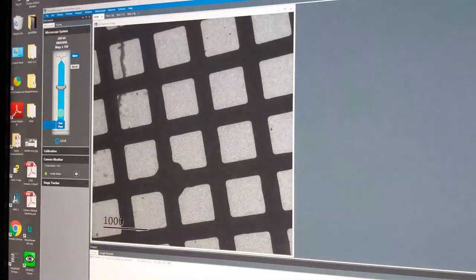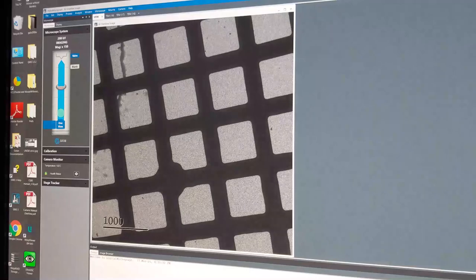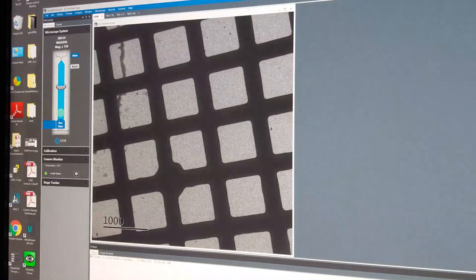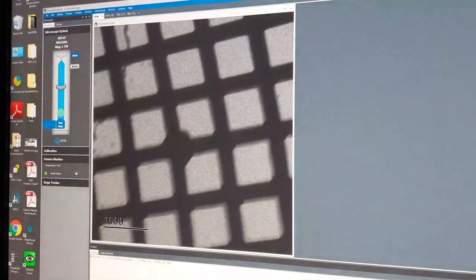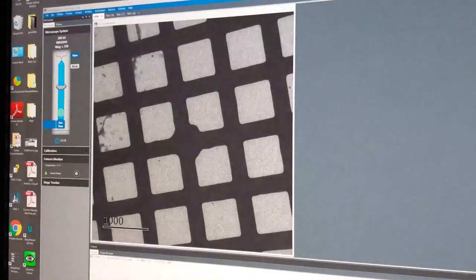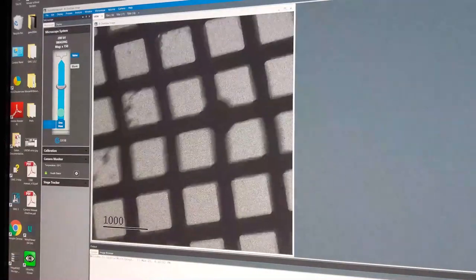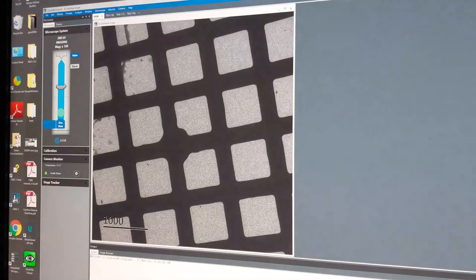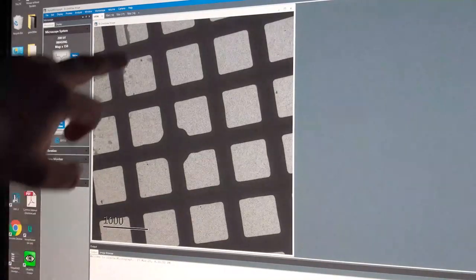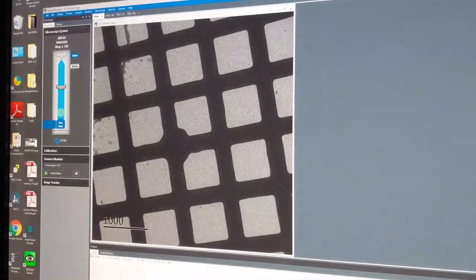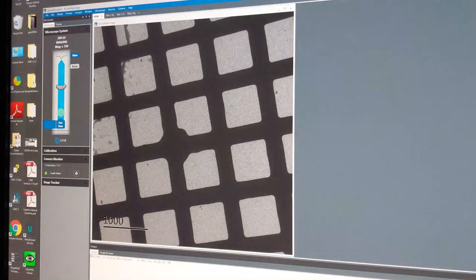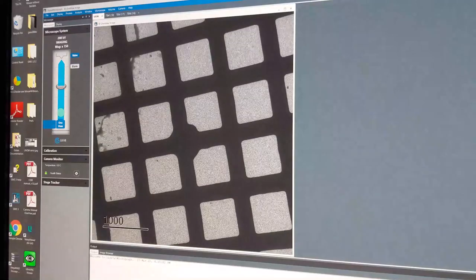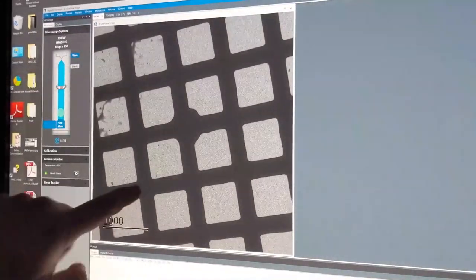With the sample inside the microscope, we can now start to view the sample. We are at a magnification of 150 times — this is a low magnification for the TEM, but comparable to a high-powered optical microscope. Moving the sample around, what we can see is almost a shadow of the sample. The dark lines are the copper grid bars that we saw on slide three, and we can just see a little portion of the copper disk.